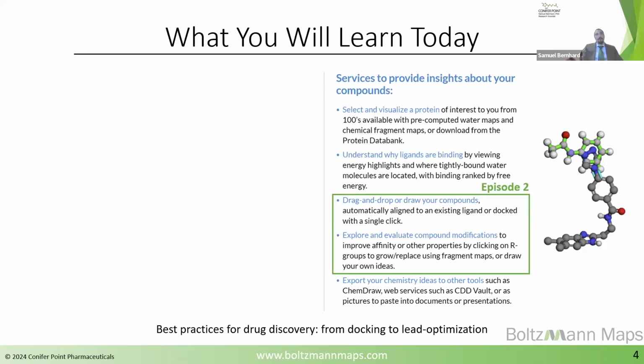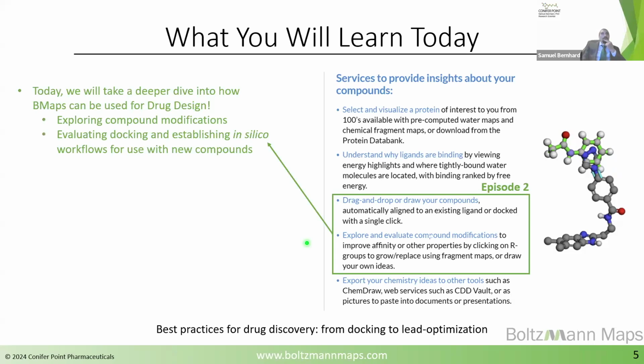So as that continuation of webinar one, today I will present the utility of BMaps as a tool for docking and lead optimization through the lens of factor 9, which is today's protein of interest, as well as a compound series that was reported on in the same paper. Specifically, we will take a deeper dive into evaluating the effectiveness of docking as a method of modeling and review common chemical characteristics found in the series today by evaluating docking poses and considering key chemical properties.